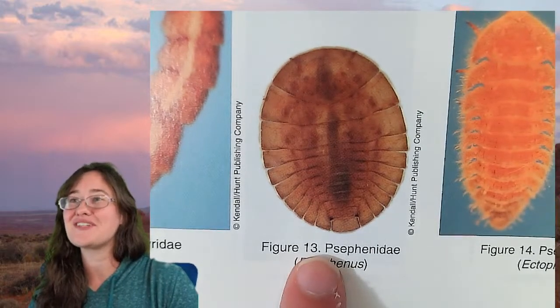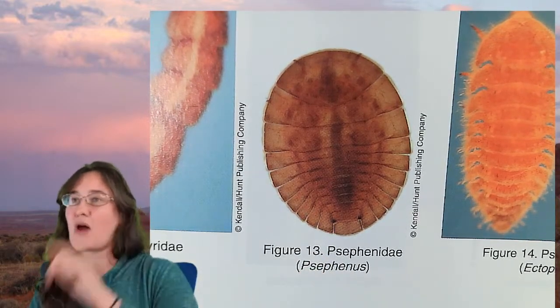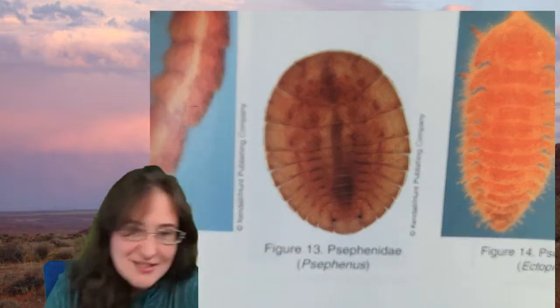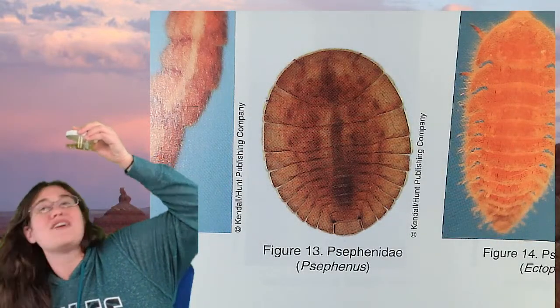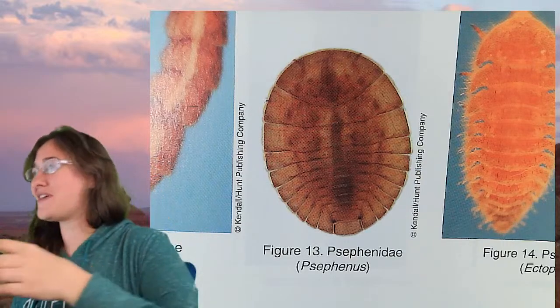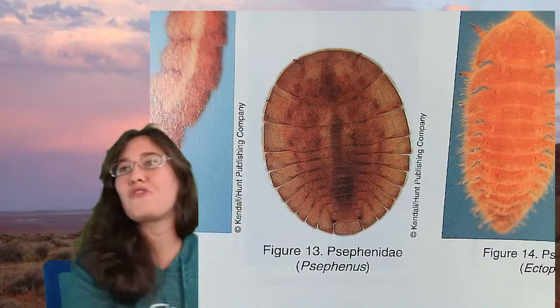I first collected them about a year and a half ago. I found them on some rocks, and I was really, really excited. And I think they're right here. Do you want to see one in real life? I can throw one under the microscope for us.